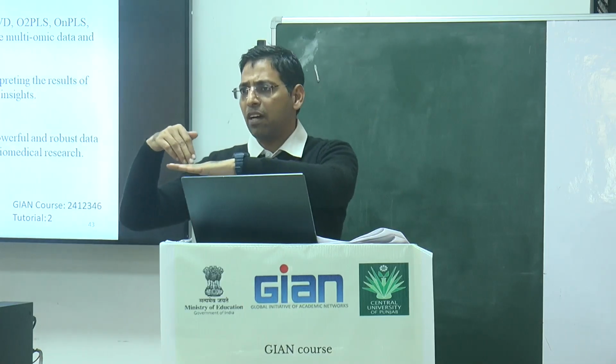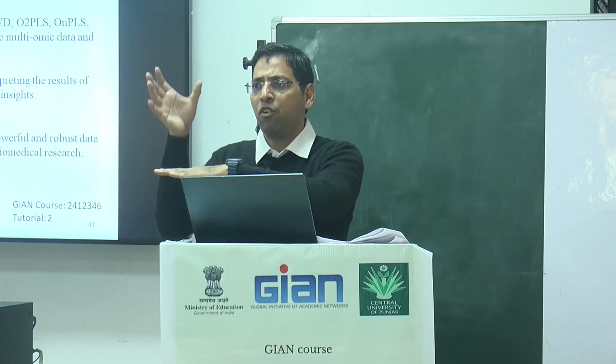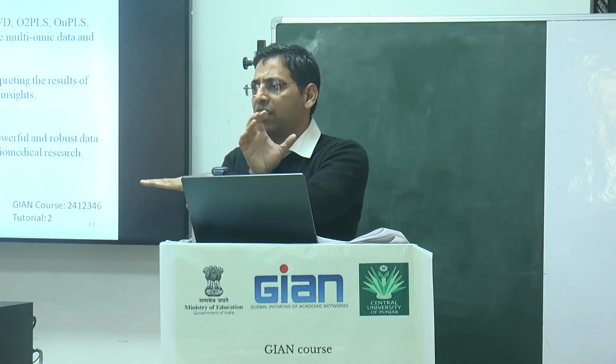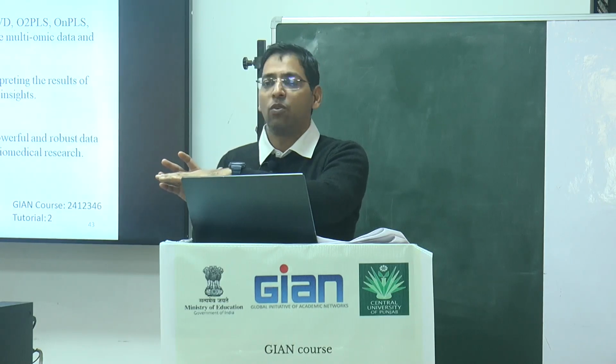So the sample comes here, and after some time it is detected. There is the gap time, first a few peaks of the solvents, then you will find the first analyte, then the second analyte. So you know that your compound has the retention time 28, but it is coming at 26 here. But originally it is 28.